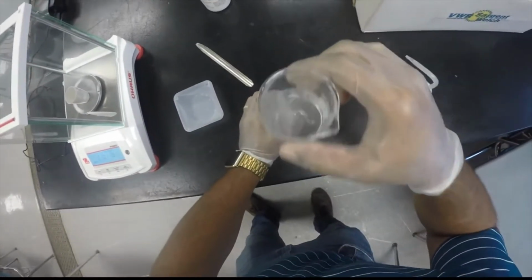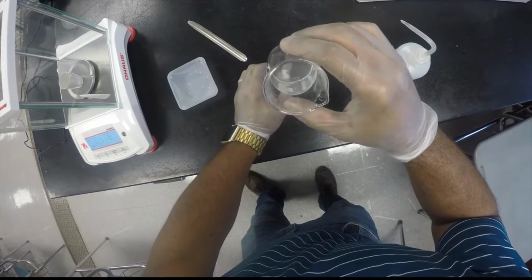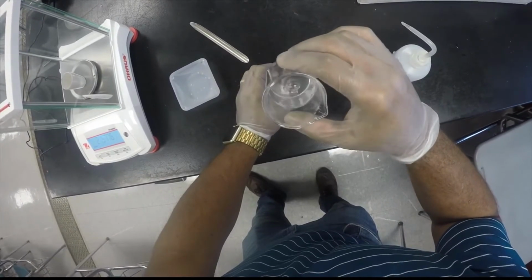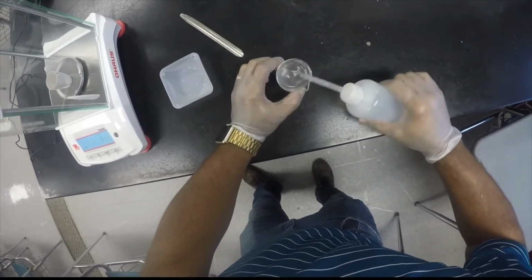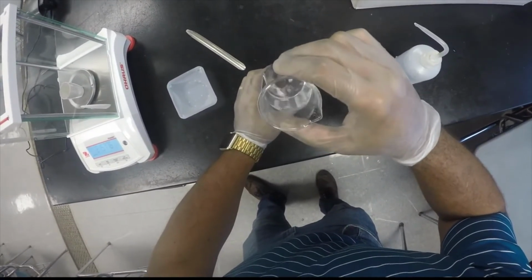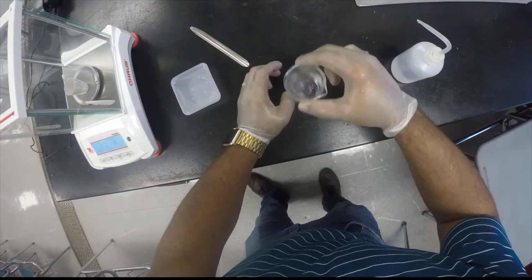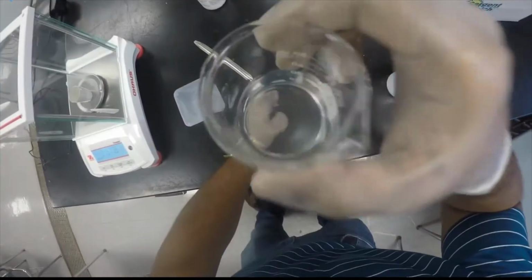Looks like I'm almost there. Still some minor turbidity in the solution. Add a little more water, make sure. Again, not important to measure the amount of water that I'm adding here. What I'm really trying to achieve is to make sure I've completely dissolved the group 1 carbonate. Okay, that looks pretty good.